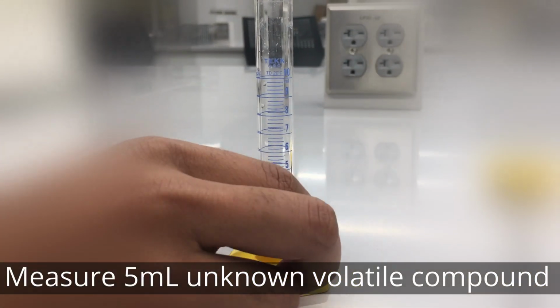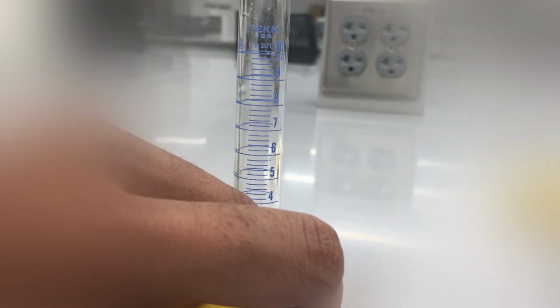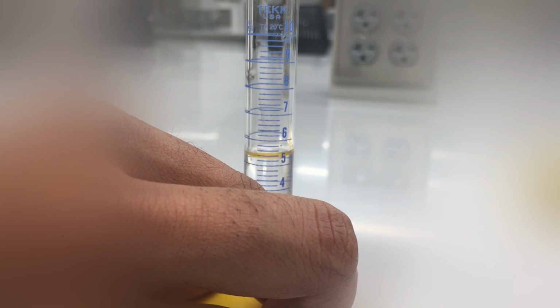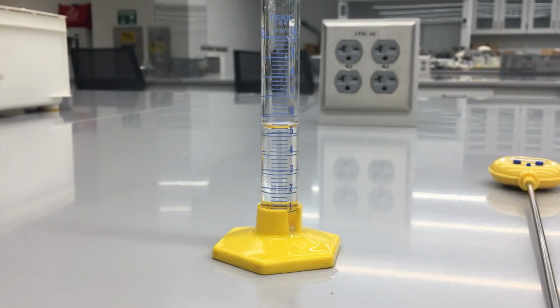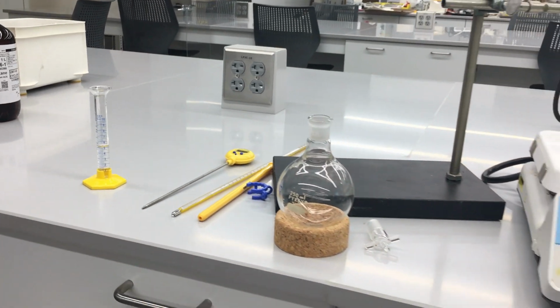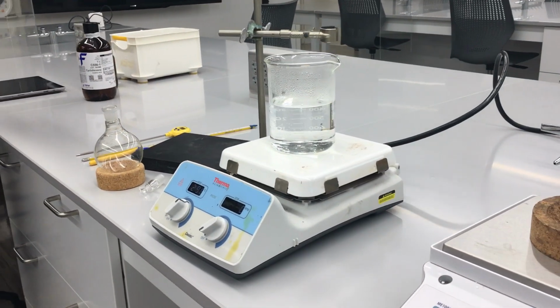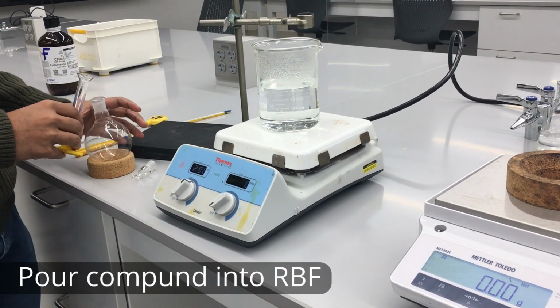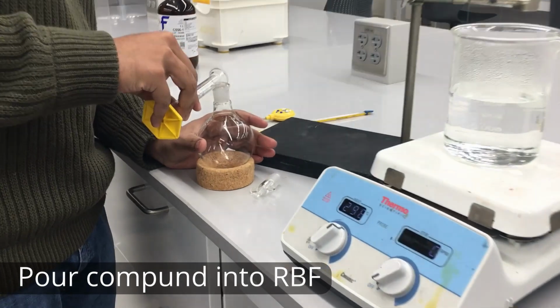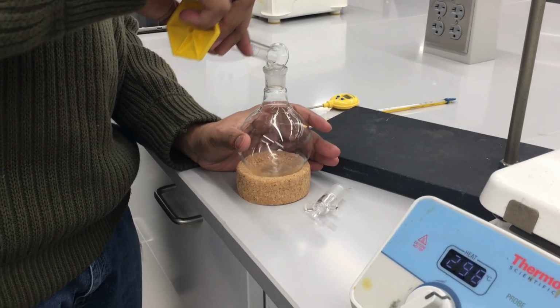Next, I'm going to measure out 5 milliliters of the unknown volatile compound into this graduated cylinder. There you go. And over here, you'll see that I have been boiling a beaker full of water. Now, before I use that, I'm going to pour my volatile compound into this round bottom flask.